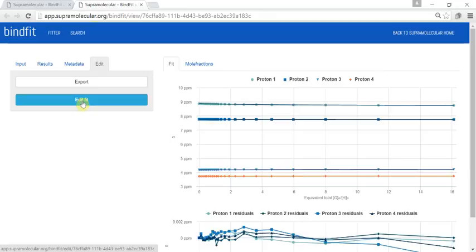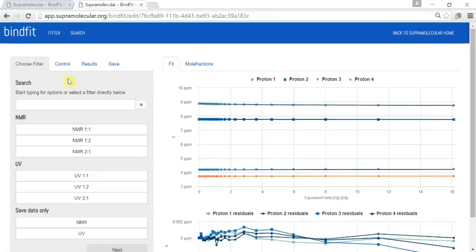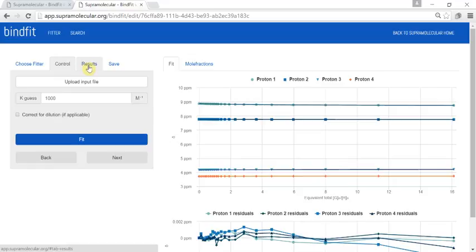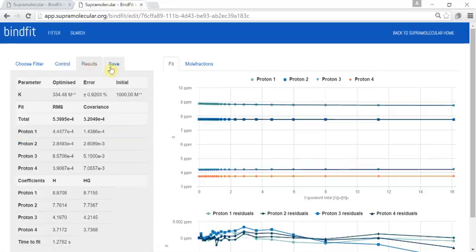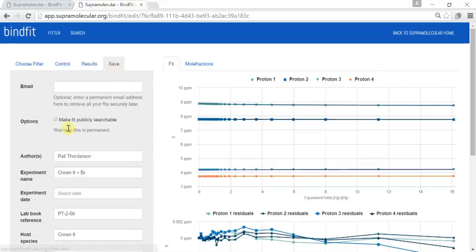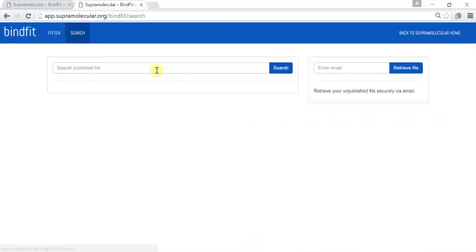You can even edit your fit, and if you wish, make it publicly available for others to search by clicking the appropriate box. For any data you have, you can always retrieve the URLs by putting your email address into the search box and we will email you all the URLs associated with your data.